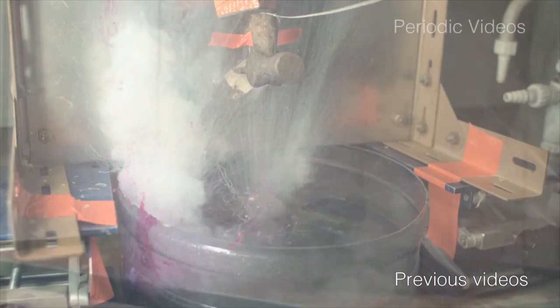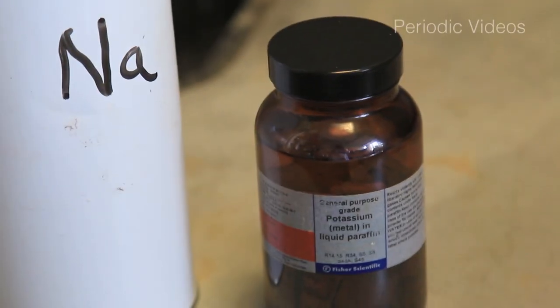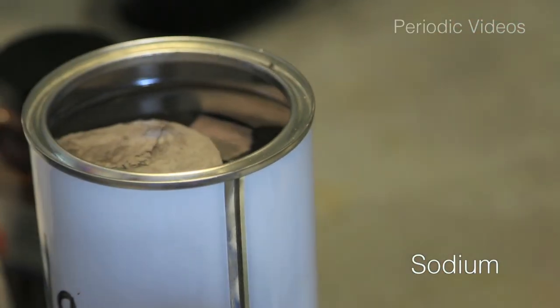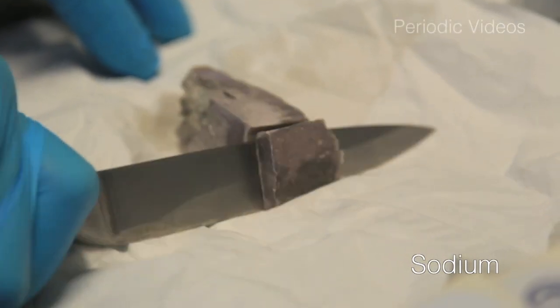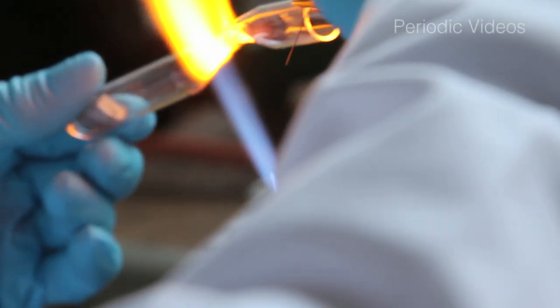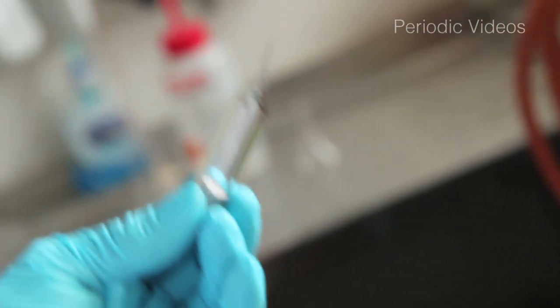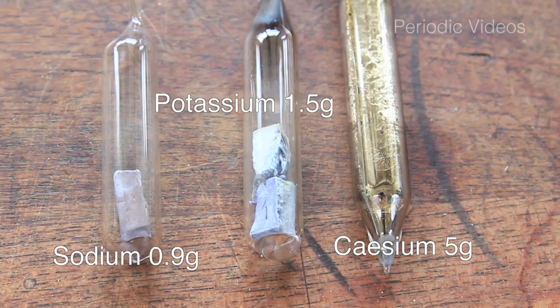We've also done the reverse experiment, water falling onto sodium. But what Neil felt is we should do something that was much more controlled. He wanted to break ampoules — glass vessels containing the alkali metals under water — so we can watch the reaction before there is any air present. He also had the idea that we should compare the same number of atoms of the three metals he chose: sodium, potassium, and caesium.